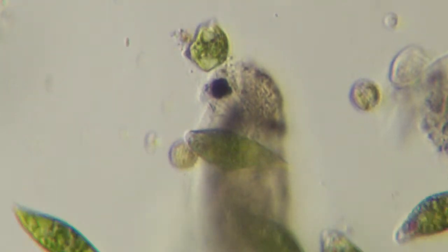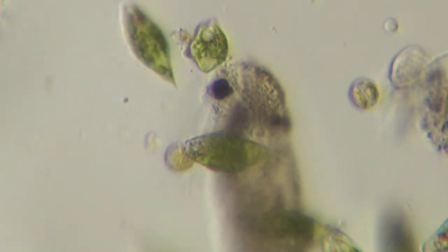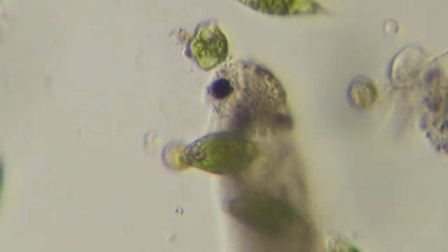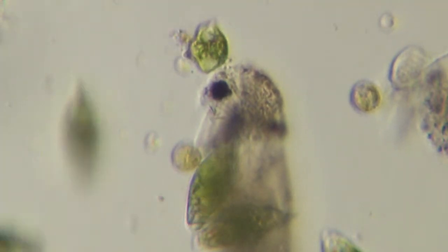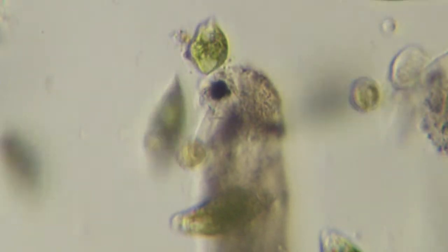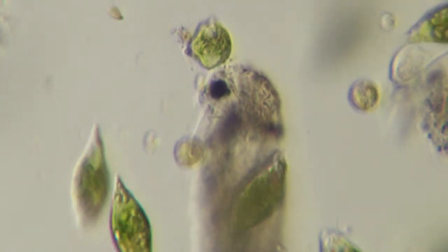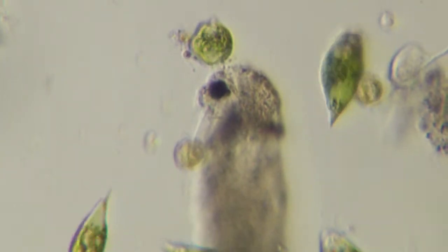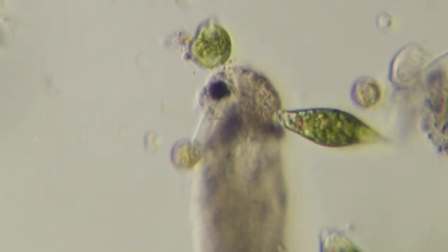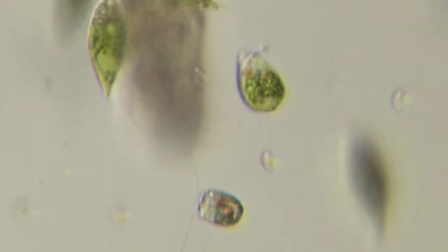Very cool. Wow, there's a whole bunch of them right here. Why do they like this spot so much? Crazy. Never seen so many Euglena on one slide ever. If you saw me on Kent's pub the other day walking around there, I collected some samples before I left, and one of the mucky pools I showed in the beginning was where I got some of these goodies. Just very, very rich.